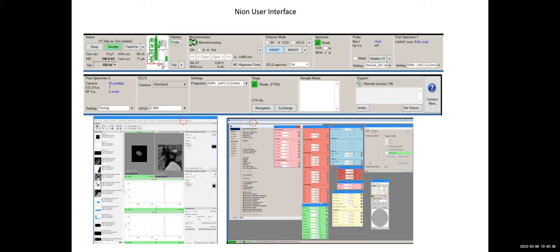When we say a setting, you already see that on the text panel, you already see settings like probe setting, right? 19 milliradians and maybe other setting values. I want to basically introduce you to the philosophy of the AS2 software. You can see that there are too many controls to choose from, right? So they try to group several controls together based on their function. Say those controls work together to define a special operating mode, and they just name it a mode, like condenser probe mode, 19 milliradians here. They just define the values for the condenser lenses: C1 current, C2 current, and C3 current. Those currents are saved in the mode.